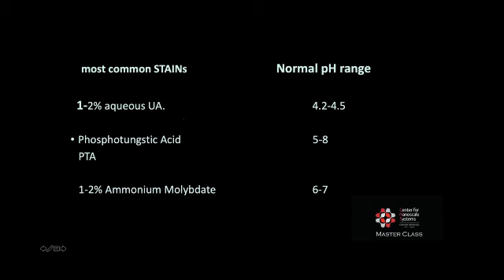I would always start with 1% aqueous UA. That's going to work with 95% of anything that you're trying to stain.